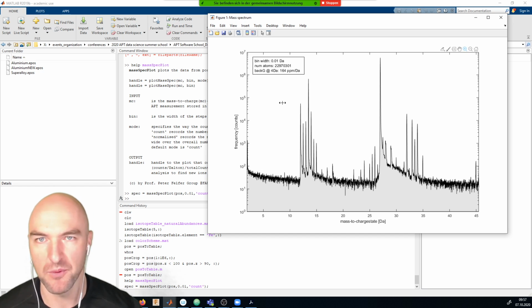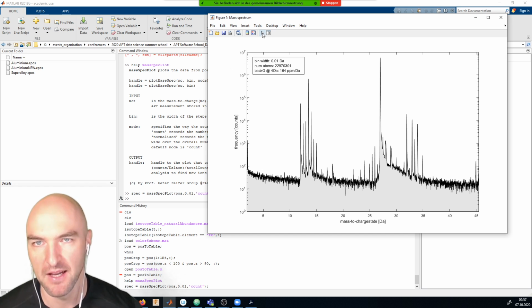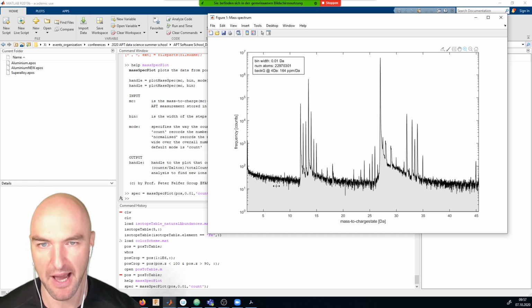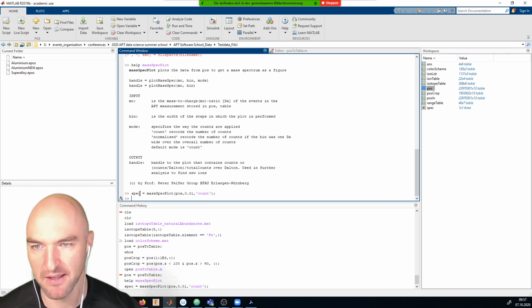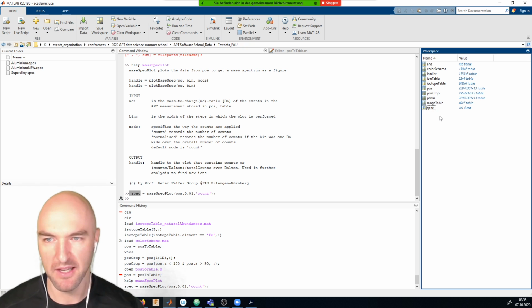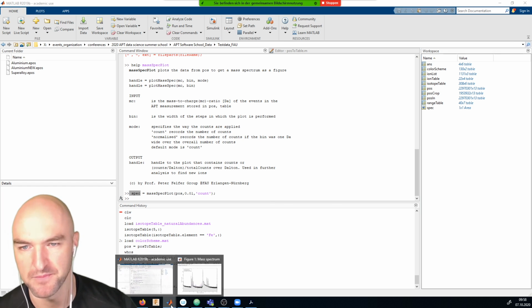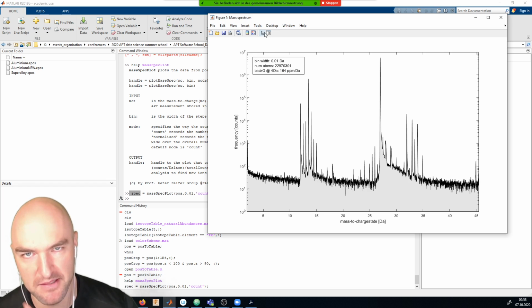So what I will next show you is how we set up these things here, with no in-depth explanation. Generally, we have a Matlab figure here that has a figure hierarchy. And our variable spec that you can see here is an area plot. This is a handle. So this is essentially a variable that represents the mass spectrum plot. It refers specifically to this plot here. It does not refer to the figure, and it also does not refer to the axis. It refers to this plot here.